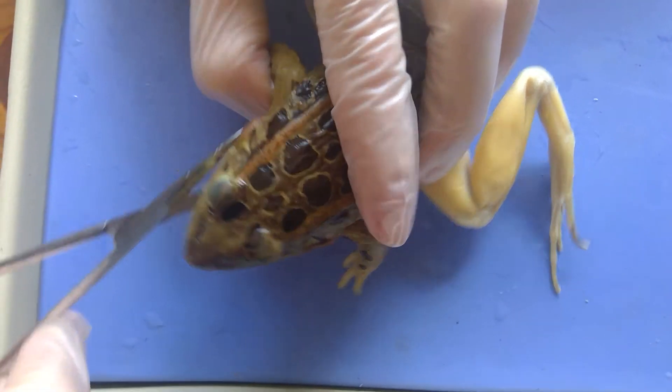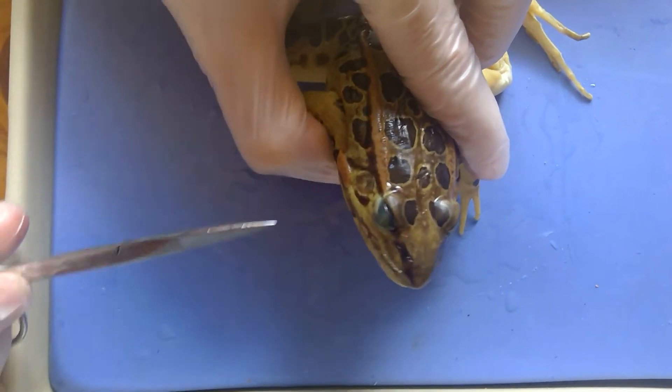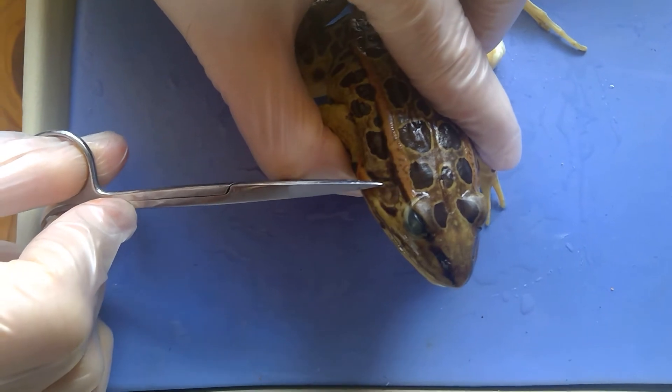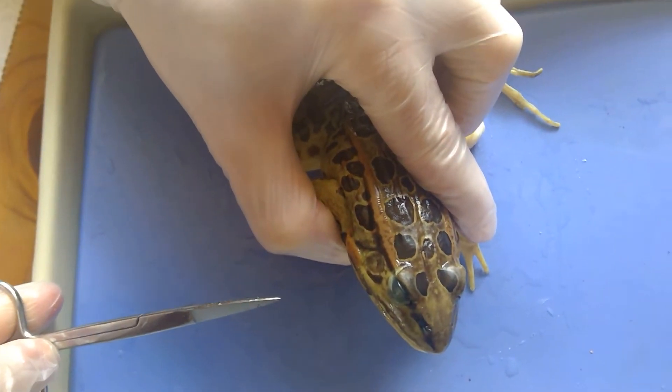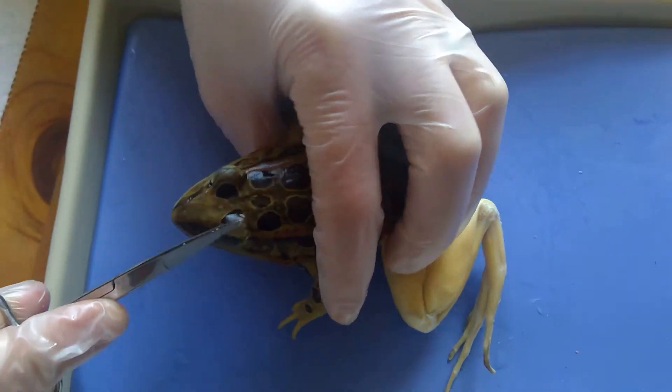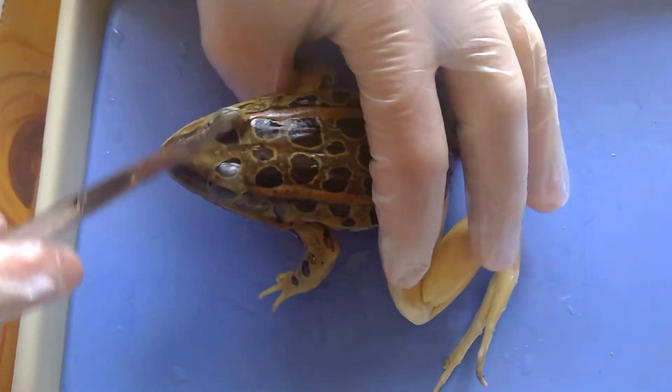So the first thing I'm going to do is identify some of the things outside the mouth. This circle right here, that's actually the ear of the frog. It's just called the tympanum. So there's a tympanum here and a tympanum here.